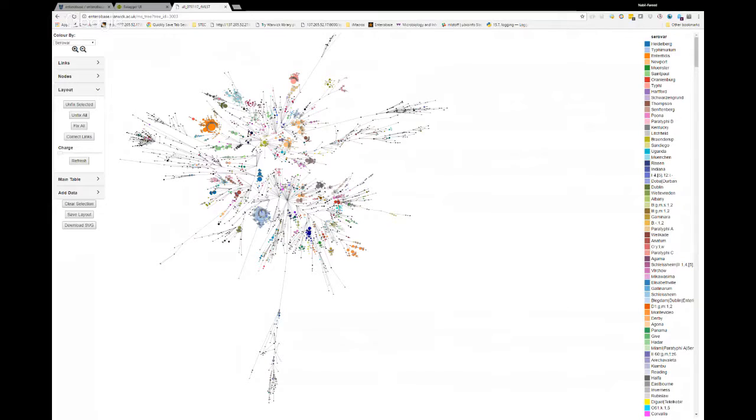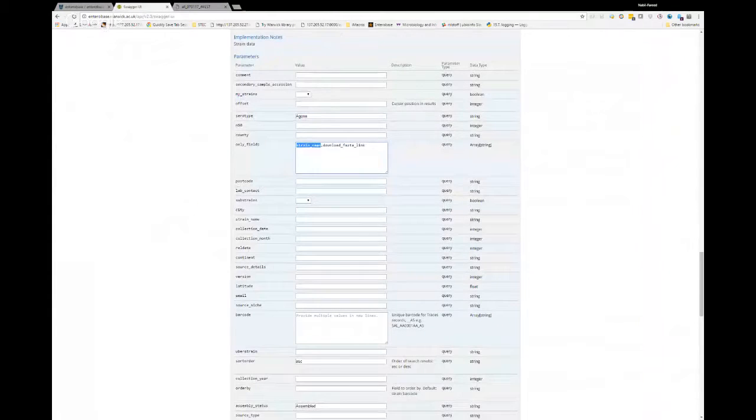That's something we don't provide at the moment, but it would be worth implementing. As Martin showed in his session, you do get an auto-correction suggestion box that gives you a hint of the value you're possibly looking for. But that's something that could be in the API as well. But we don't provide that at the moment, no.